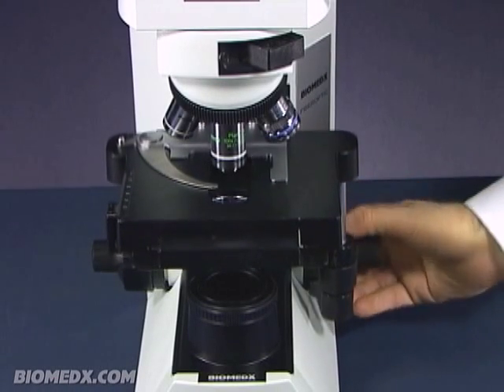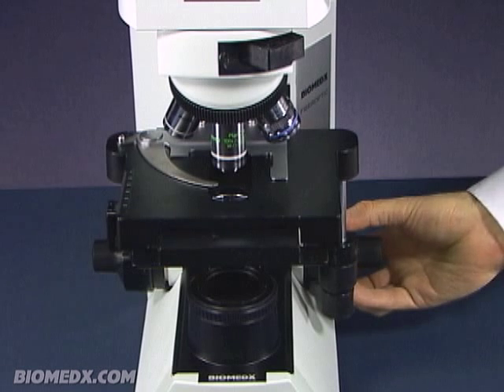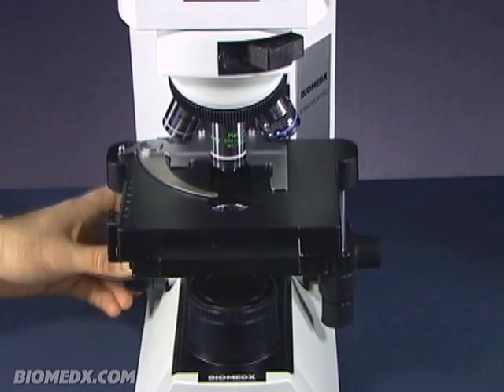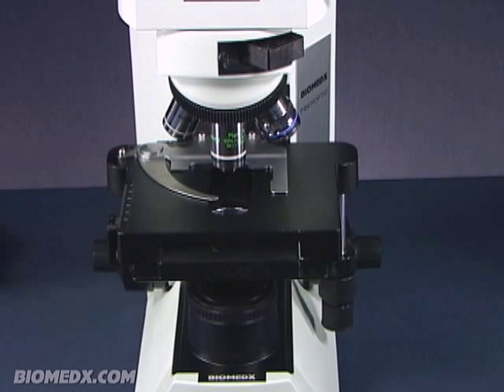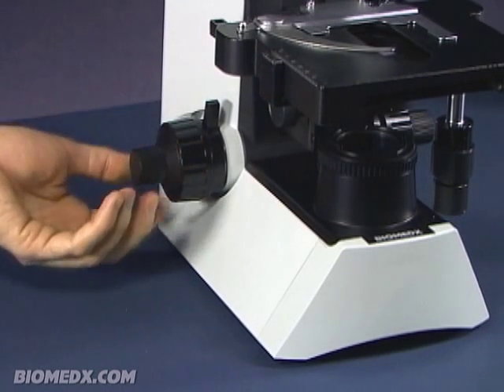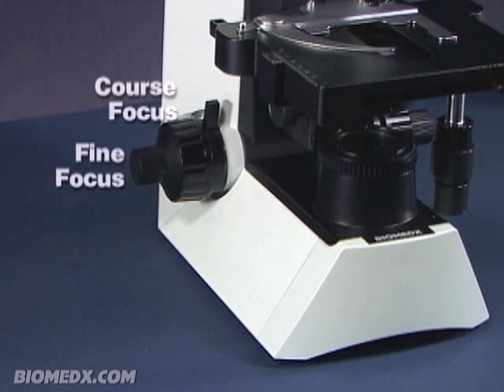You will note that the stage raises and lowers by rotating the focus control knobs which are situated on either side of the microscope. Your specimen is focused by the raising and lowering of the stage. The outside of the focus knob is the coarse focus and rotating it moves the stage up and down, and the inner part of the focus knob is the fine focus and rotating it moves the stage ever so slightly.